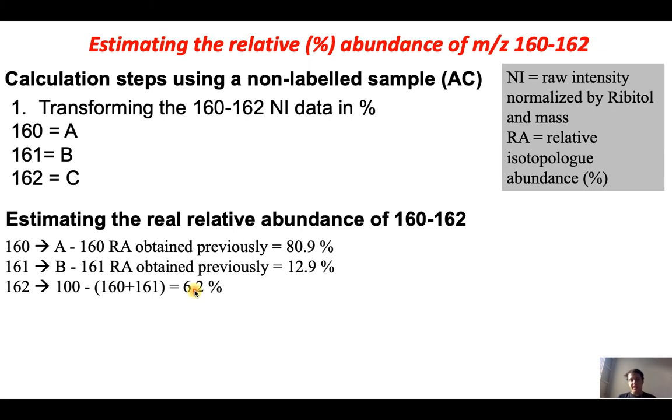With this, we can calculate the 13C enrichment in the 157 and also in the 160. But the 157 we don't need, because the 319 is already a nice fragment that contains the same carbons from the glucose. So we did all of this to get the information from carbons 1 and 2.